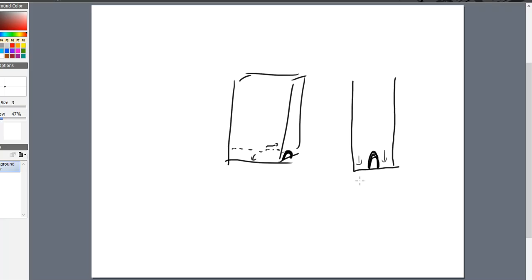So this is what we call a twin trough. Again, we've mentioned this before. A twin trough chamber, TTC, if that's how you want to do it. There are other ways to abbreviate it and other ways to call it, but it is a twin trough chamber.